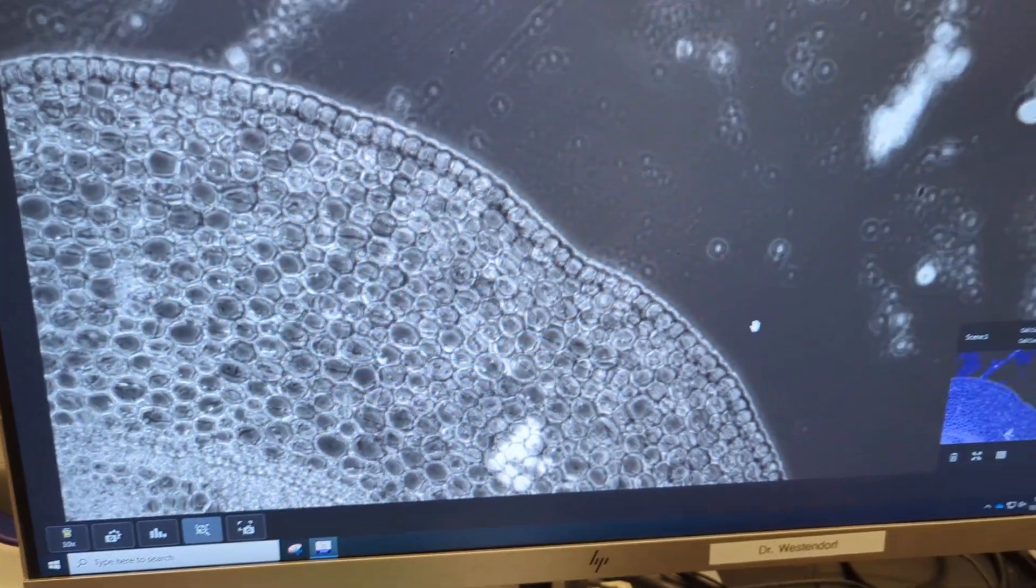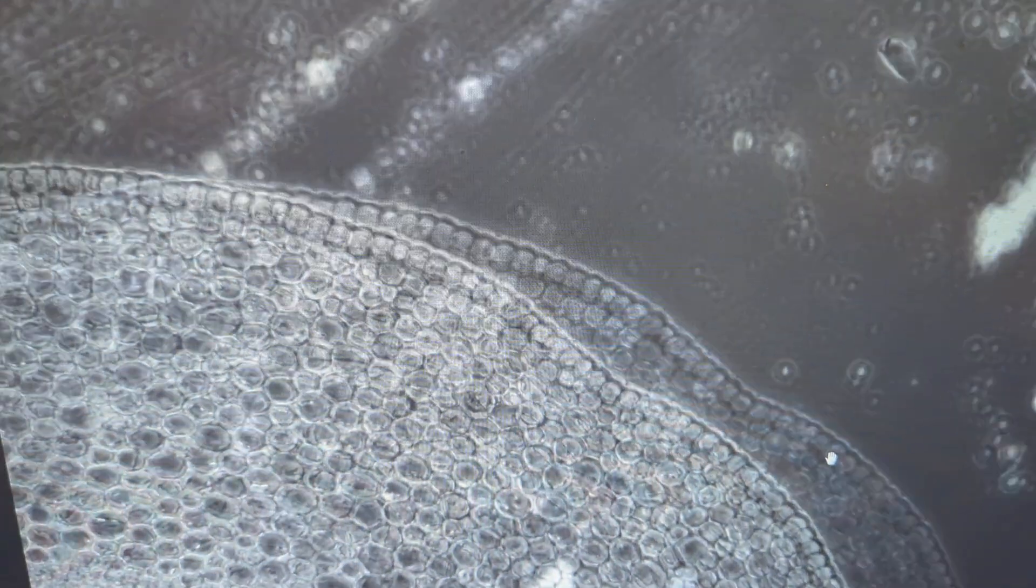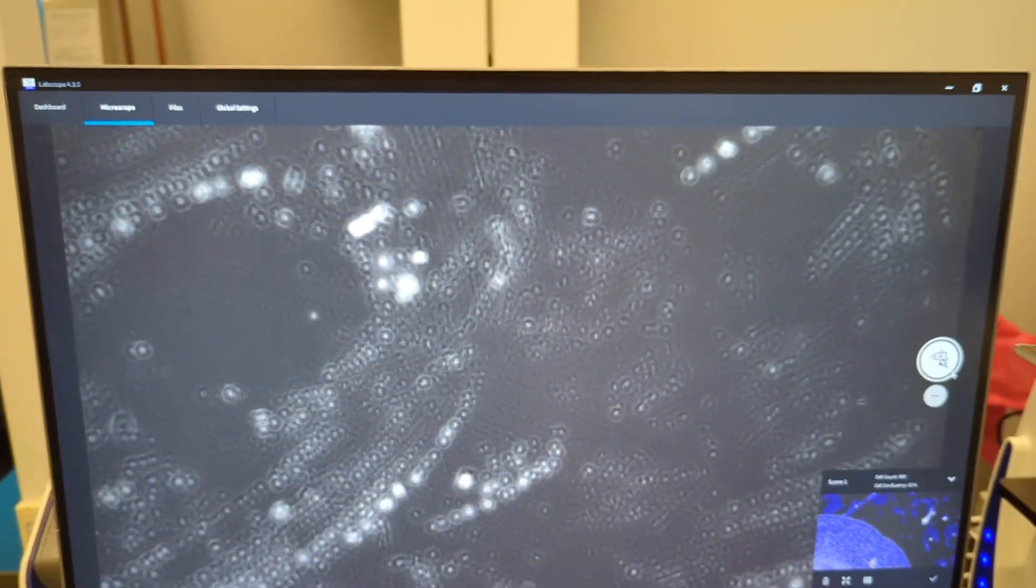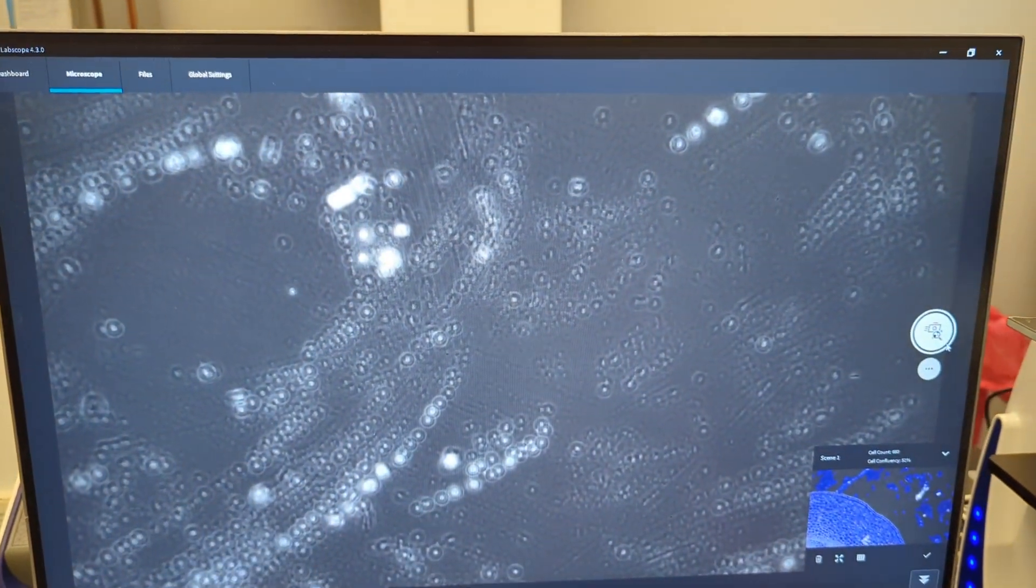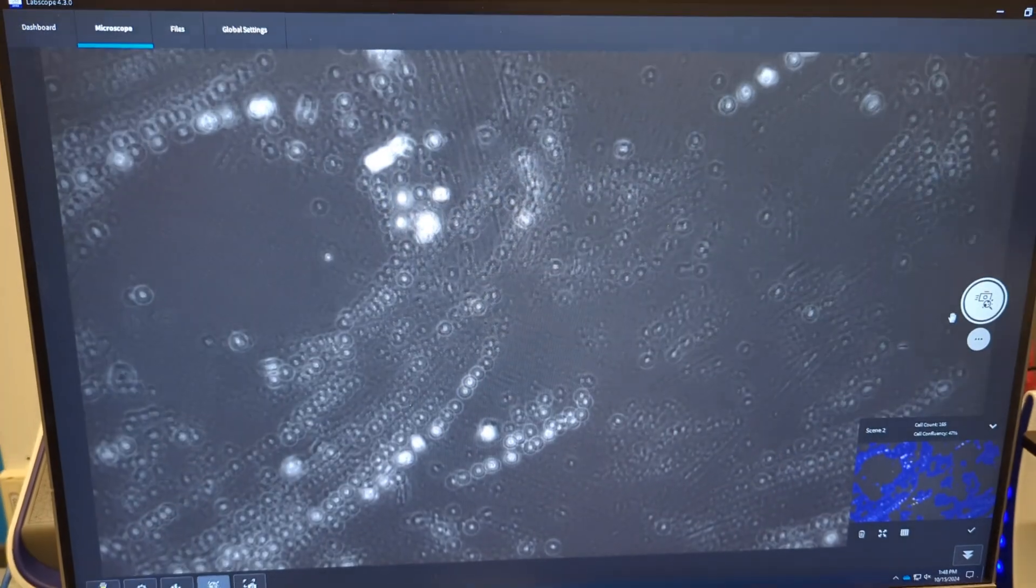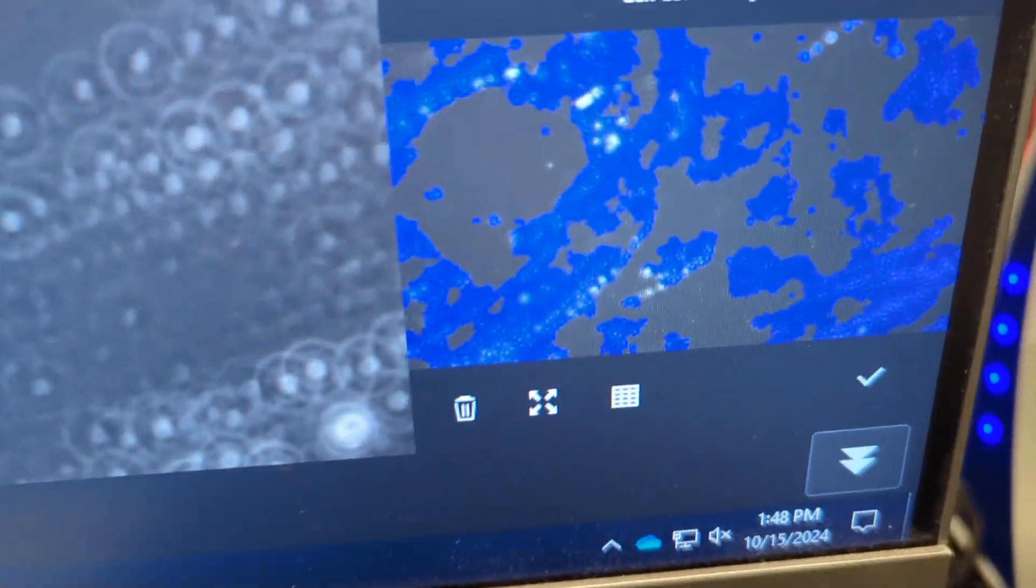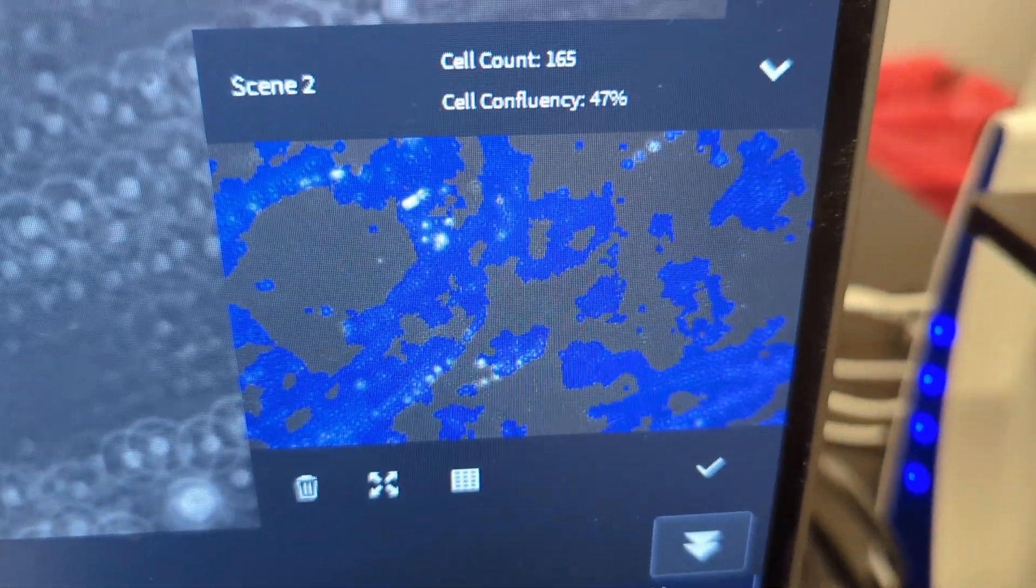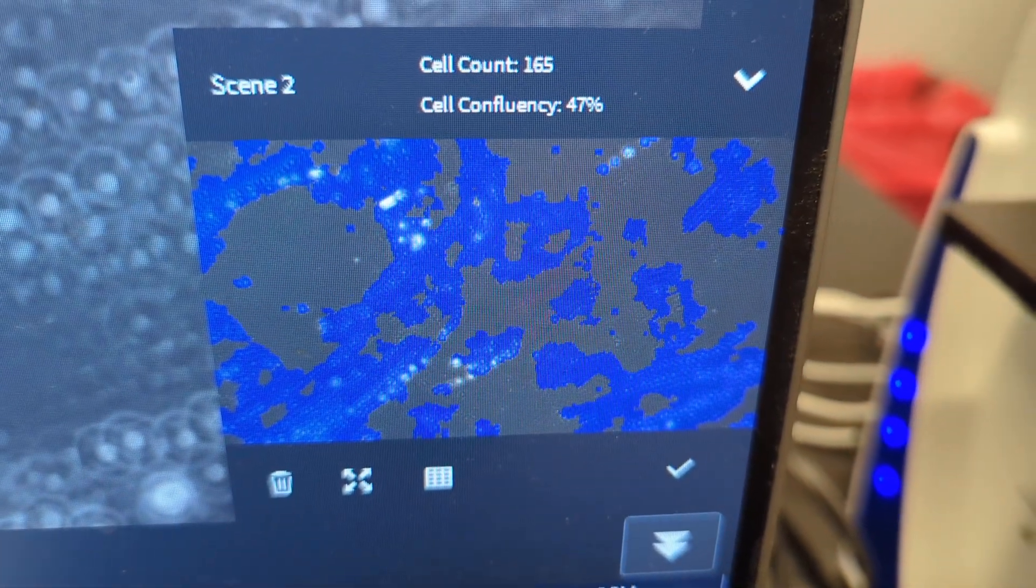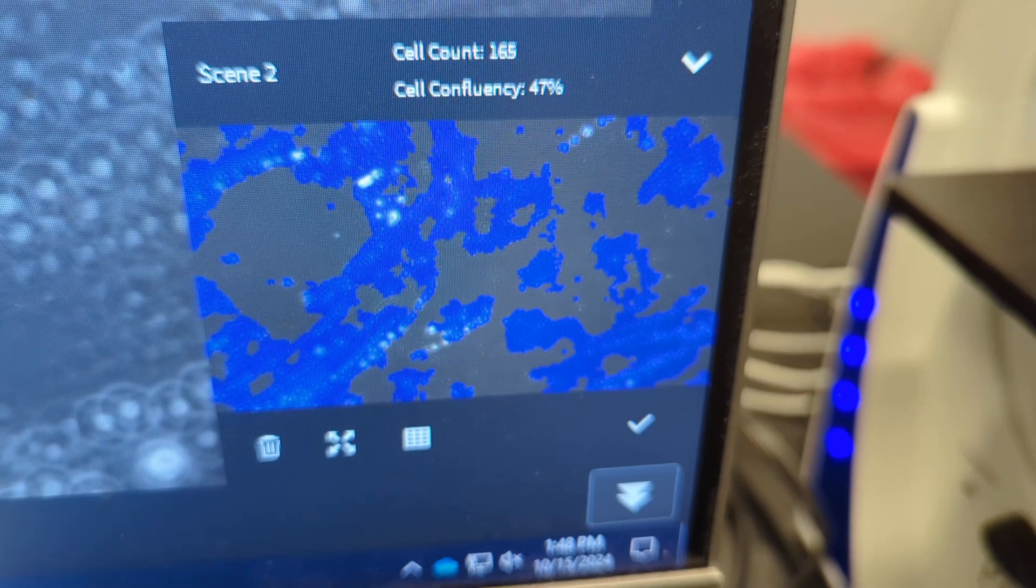And now let's do another one. Let's move the sample a little bit, so it gives us a different image. Capture the picture. And you'll see, now it's scene two from that image. And it did the count and confluency.